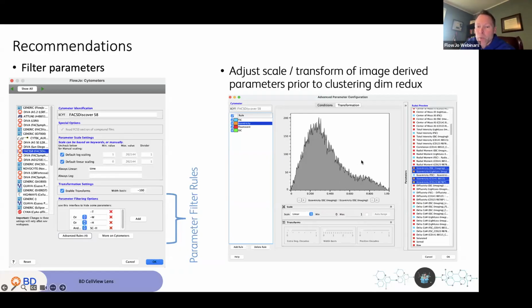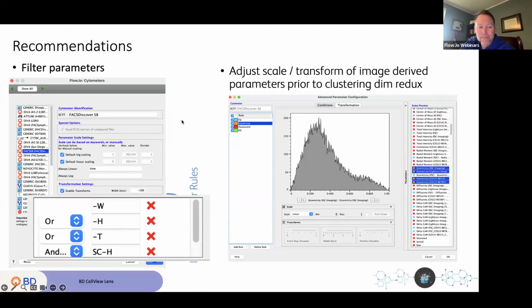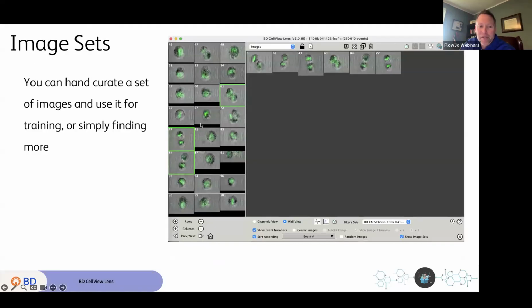It's nice in that you will actually get a graphical preview of what it is that you're adjusting and can just adjust it till it looks right and then hit go, or okay, as the case may be. So anyway, my data should look okay when we start working with it, mostly because I've set my preferences for the S8.